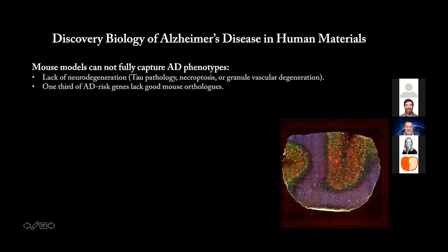Yes, thank you. I think that's a fantastic question. Vasculature is particularly hard to analyze by single cell and single nuclear approaches. And I also think that will probably be a niche for spatial technology. However, for all the spatial analysis, that will highly depend on whether we have the capability to do the image analysis and identify particular images or pixels, whether they belong to the blood vessels. So for the most part, we did not put that much effort into image annotation of where the vessels are localized and what the corresponding transcriptomic profile is. But that's definitely our next focus.